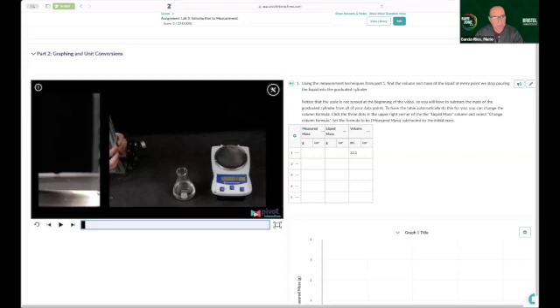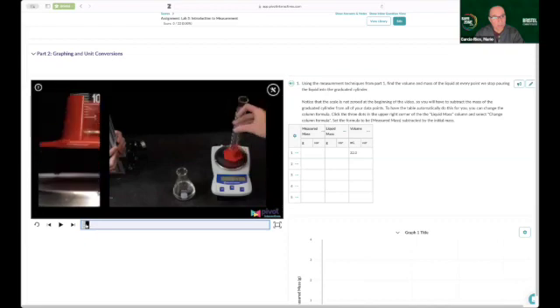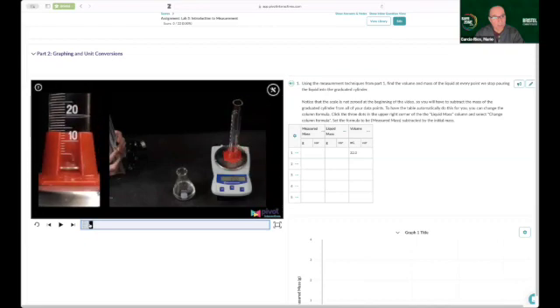So this scale is at 0. But once we place the cylinder on it, it has a readout, 96.4. So keep in mind that mass. Now the cylinder is empty. So look what I'm going to do with this table. I'm going to move this 22 to the second measurement. And I'm going to erase the 22.0 and simply make it a 0 because there's nothing there.